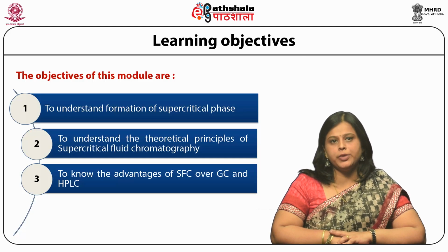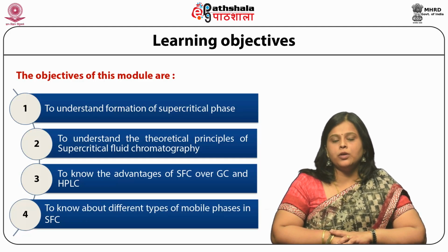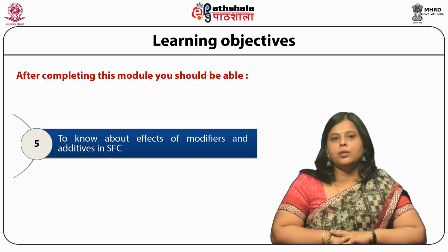chromatography, that is HPLC, to know about different types of mobile phases used in supercritical fluid chromatography, and to know about the effects of modifiers and additives in supercritical fluid chromatography. Supercritical chromatography is an evolving separation technique.